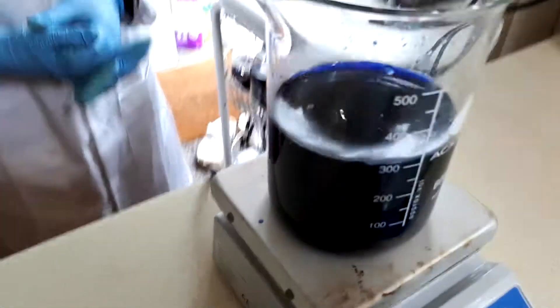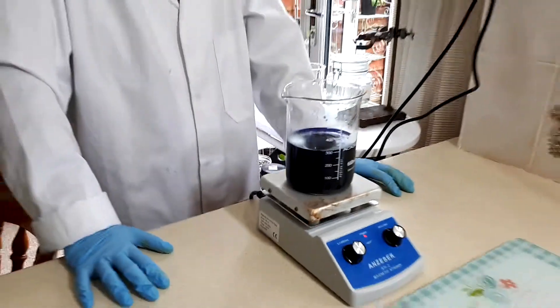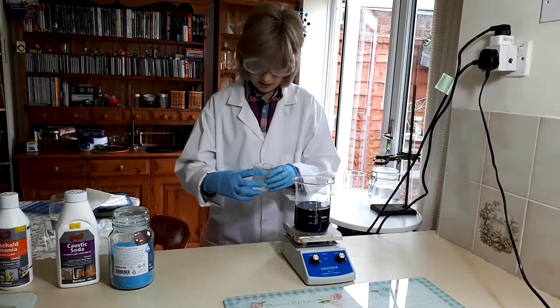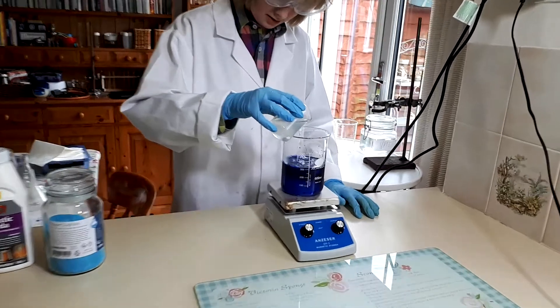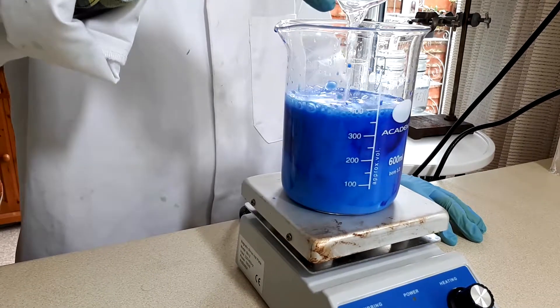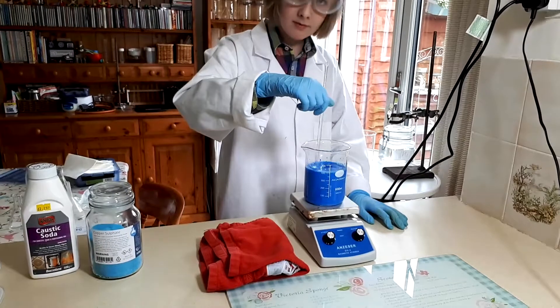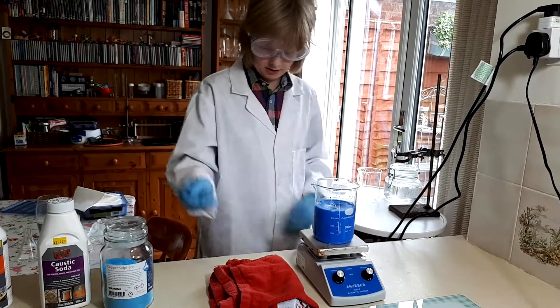Just to mix it thoroughly, I've put the stir plate on again. Now I've got my really nearly black solution, and I'm going to add my sodium hydroxide. You can see it's made a lovely light blue colour — that's because all the copper hydroxide has precipitated out.